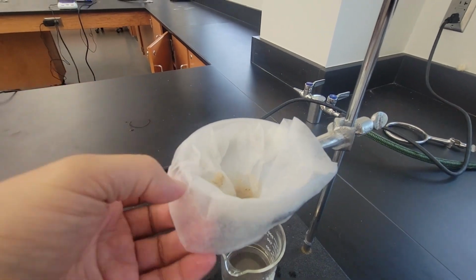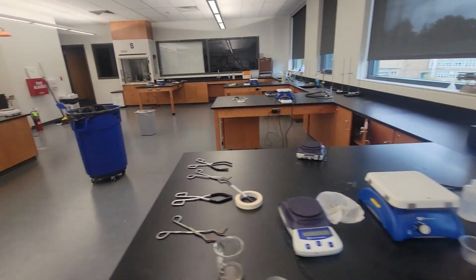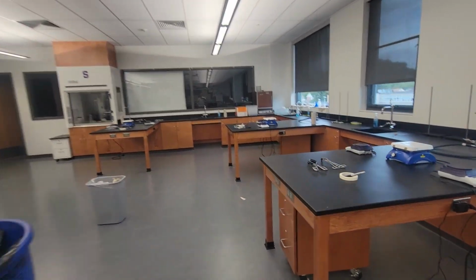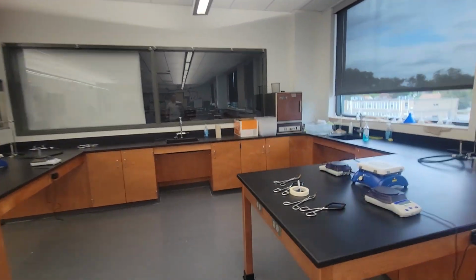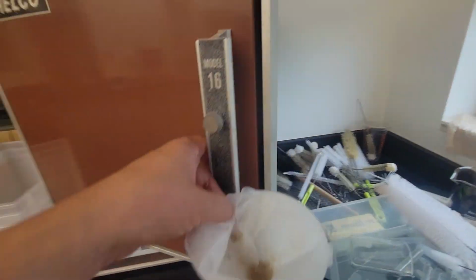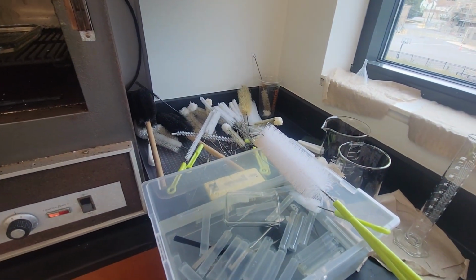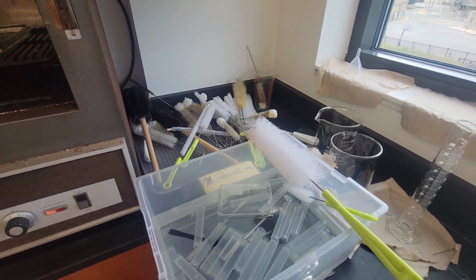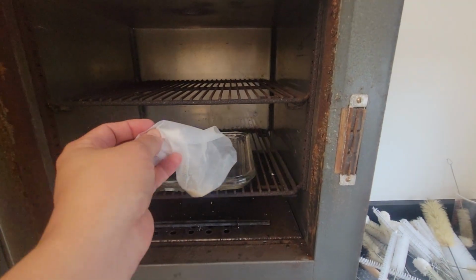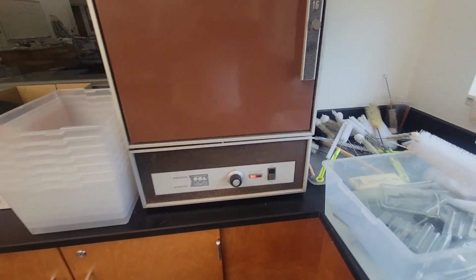All right, let's take this guy over to dry. Stick that guy in the oven. The funnel will melt, so let's just take it out of there. And check back in 10 minutes or so.